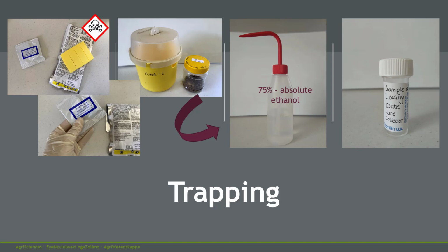Vials must always be properly labeled with the information as indicated above. You should always include the host if your samples were reared from a particular plant. It is best to place the label inside the vial as well, as the outside often fall off or smudge. Use a pencil or pen with insoluble ink for this purpose, preferably on high-quality Teflon paper. You will need a coding system to give your trap a unique reference number. Most institutions have such a system in place.